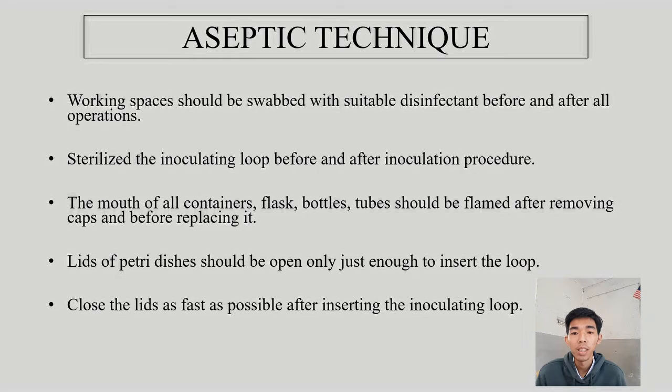The inoculating loop is sterilized by passing it at an angle through the flame of a gas burner until the entire length of the wire becomes orange from the heat. In this way, all the contaminants on the wire are incinerated. Never lay down the loop once it is sterilized, or it may again become contaminated. Allow the loop to cool down for a few seconds before contacting the inoculum. This step is important to avoid killing the microorganism.